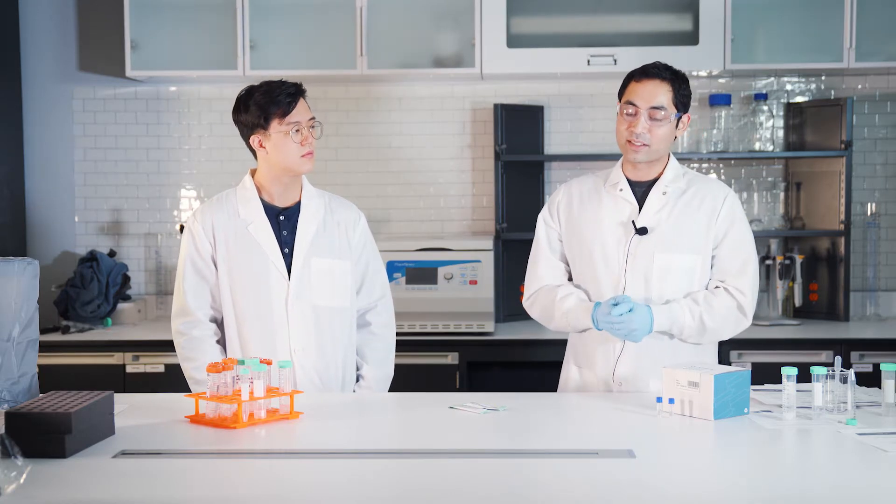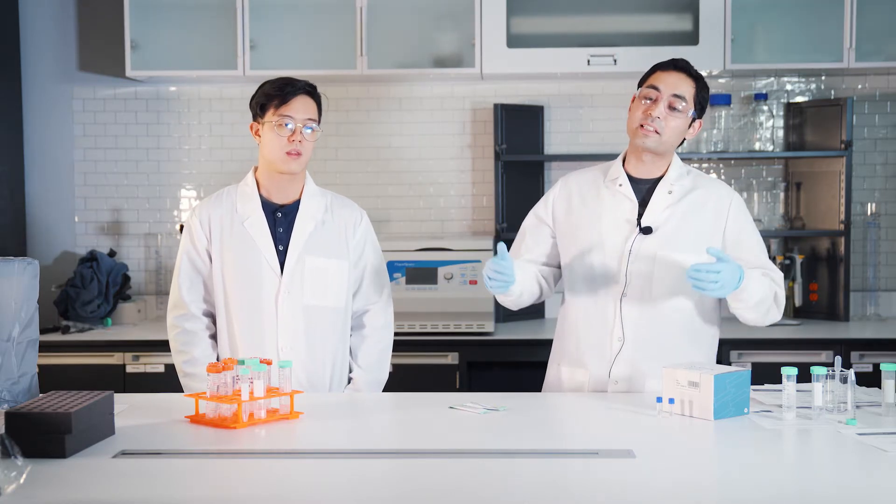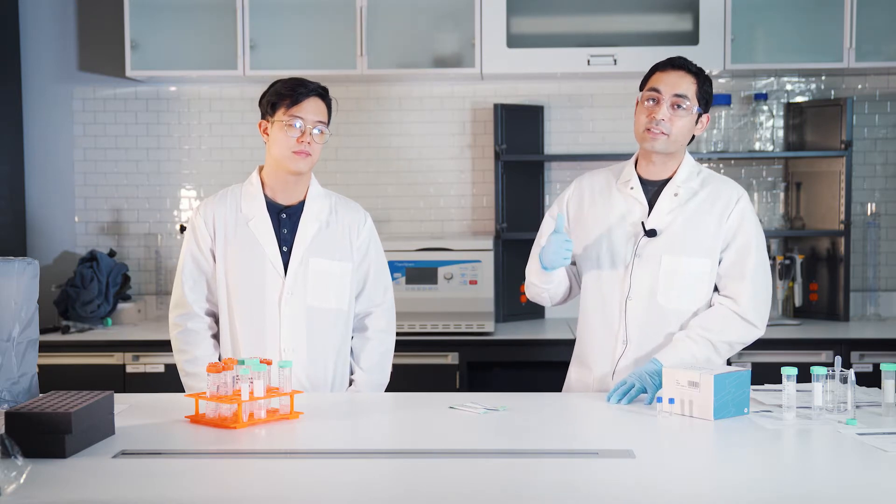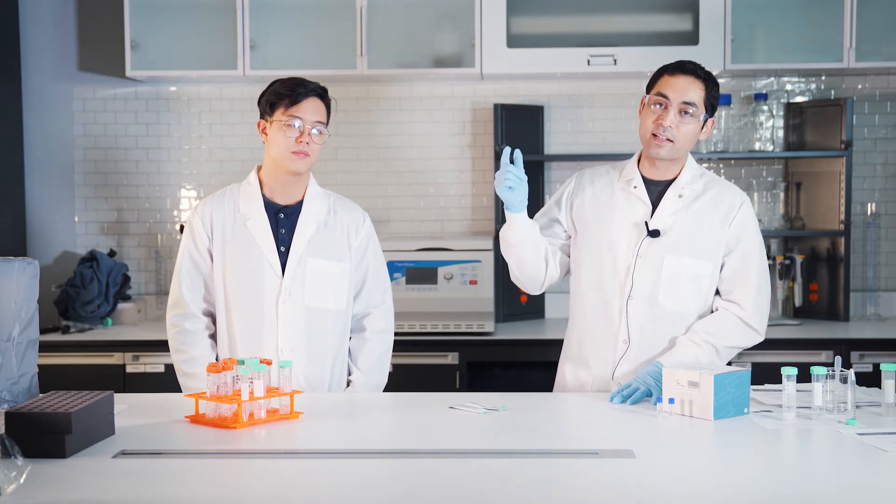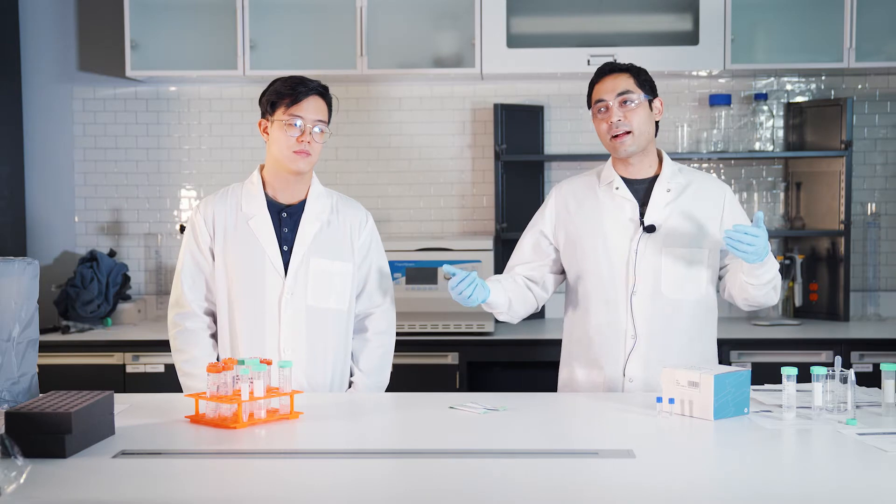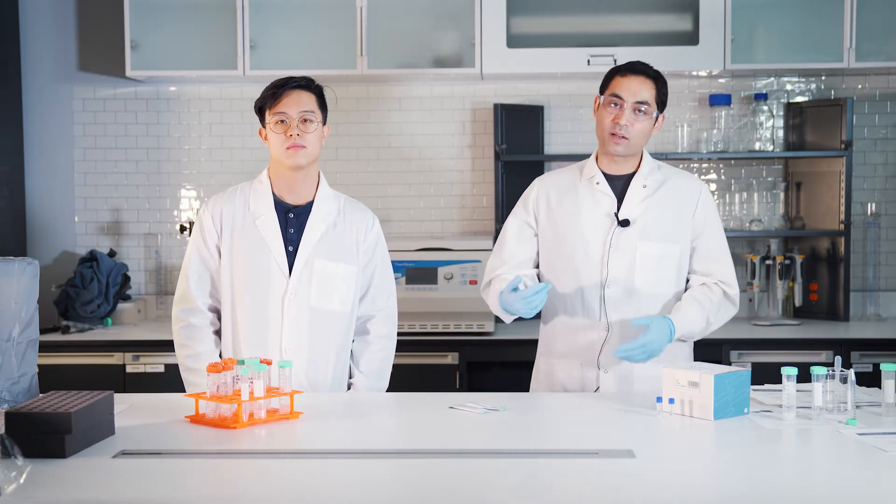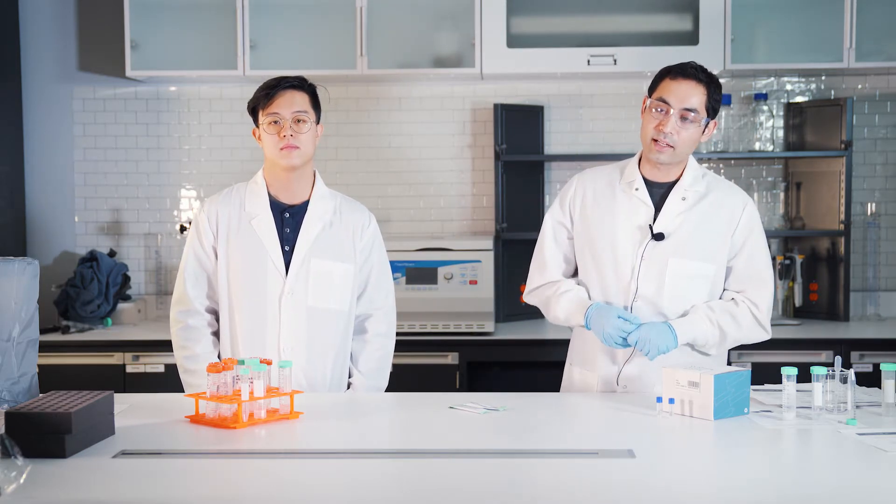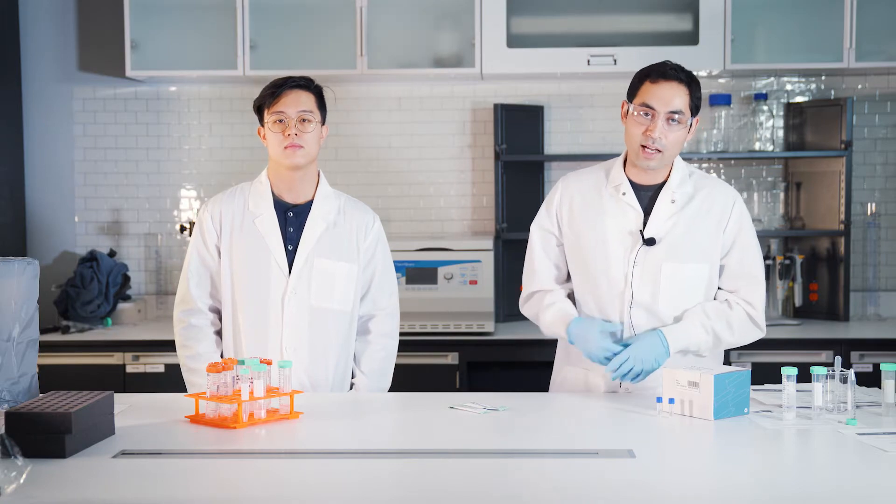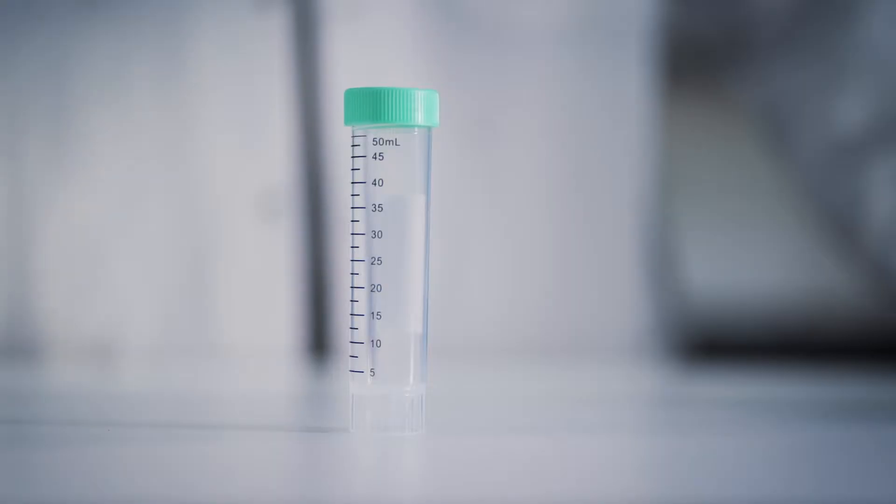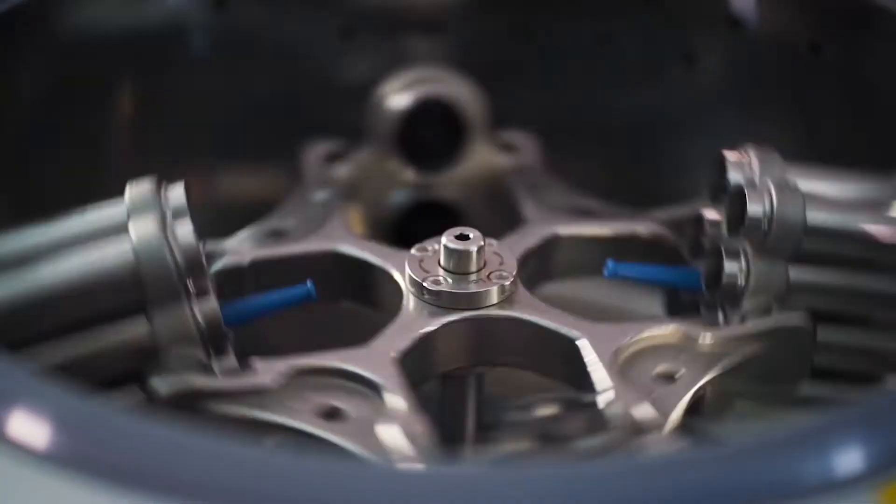It's really handy, it definitely simplifies sample prep big time. In the past you had to use a ton of solvent, glassware, chlorinated solvent - nobody wants that carcinogenic stuff around. With this one you use a lot less solvent, you're just using centrifuge tubes, you mix mix mix, shake shake shake, spin down - that's essentially it.